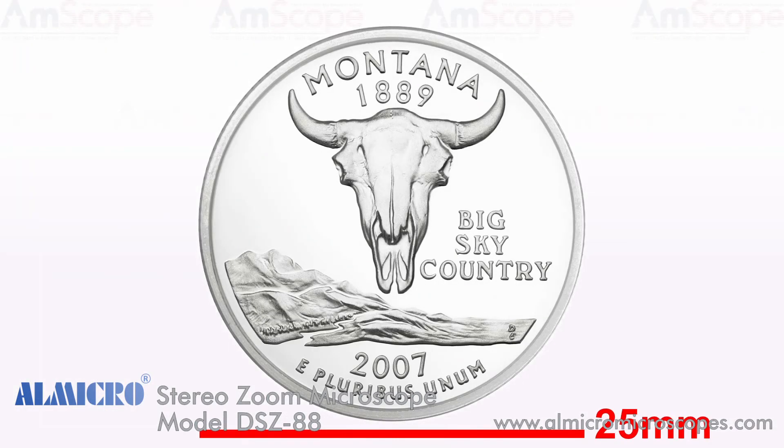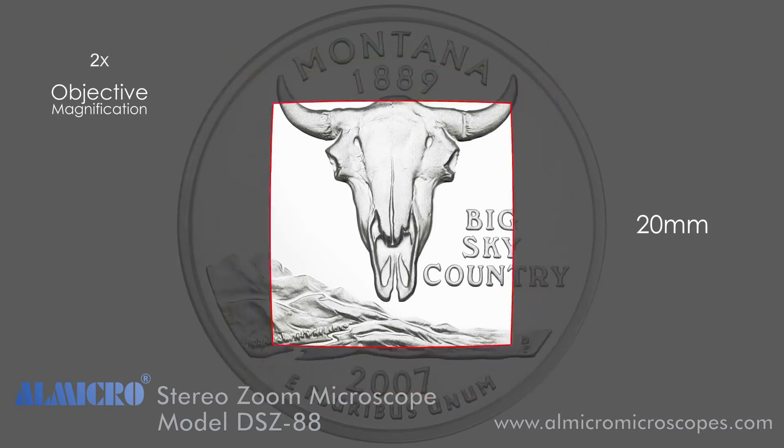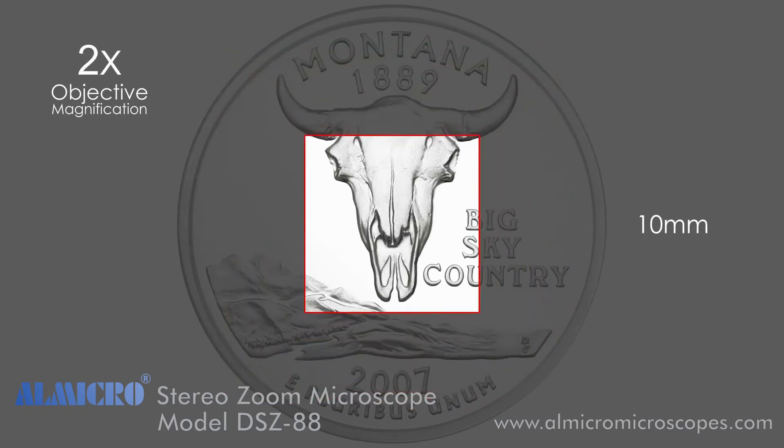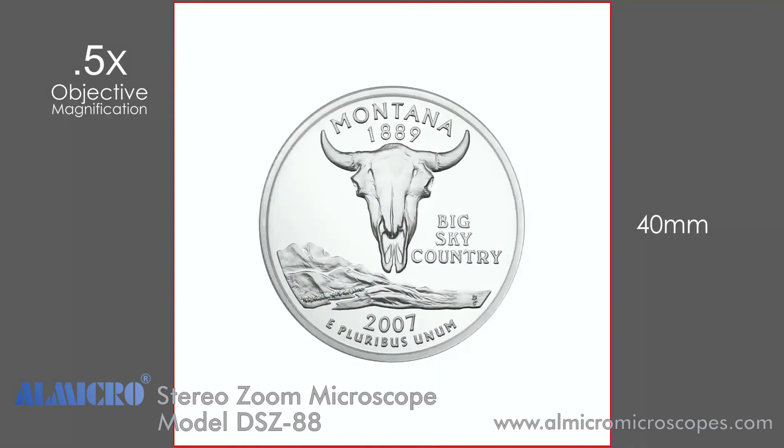This U.S. quarter is about 25 millimeters in diameter. With a field number of 20, at one times magnification the field of view is 20 millimeters, which shows most of the coin. At two times magnification the field of view is only 10 millimeters, showing a much smaller portion of the coin, and at four times it's only 5 millimeters. With a fractional magnification such as 0.5 times, the field of view is now 40 millimeters, which allows us to see the entire coin.